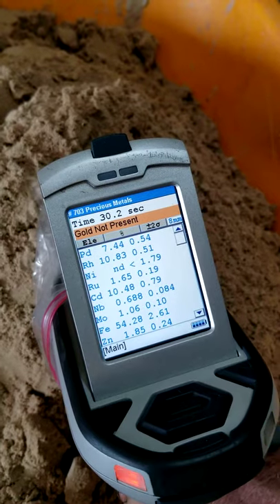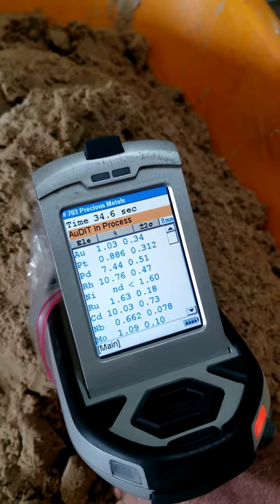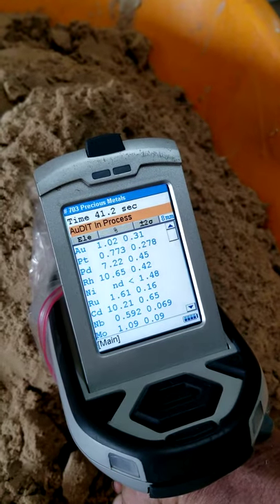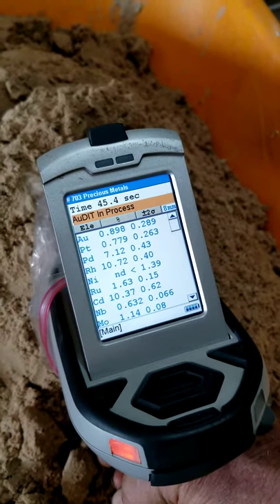So this is showing palladium at the top, 7.44. Oh, now look what popped up — 1.04 gold, now it's 0.933, you see at the top. This is just giving an example that even our raw ore we can test to show gold.